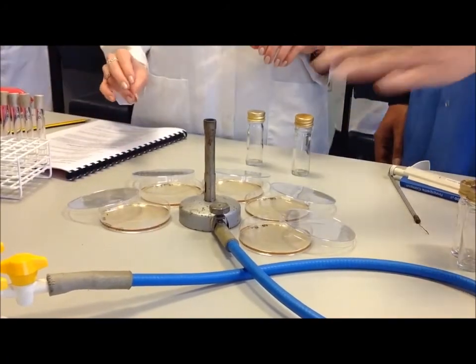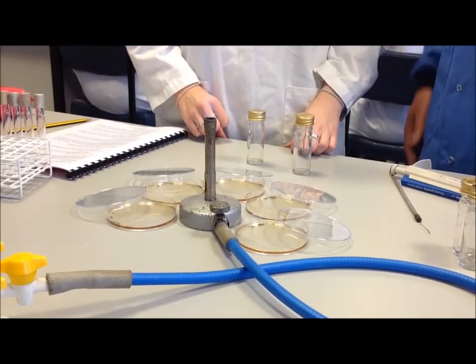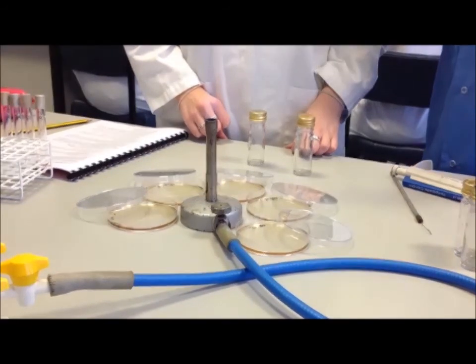And then as long as the agar plates are kept close to the Bunsen burner, they can be left with their lids ajar to dry, and that prevents excessive condensation accumulating on the lid of the agar plates.